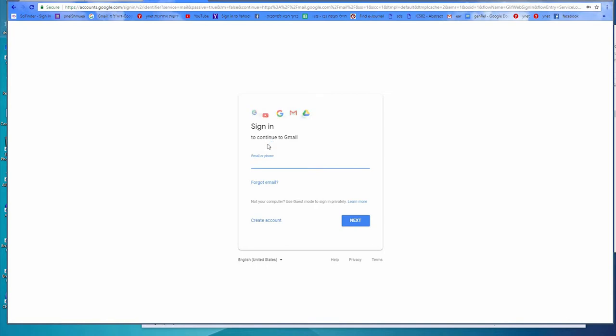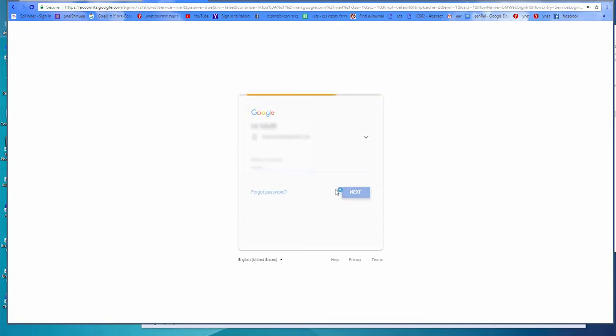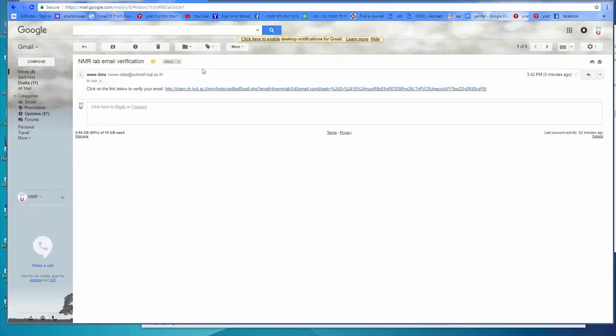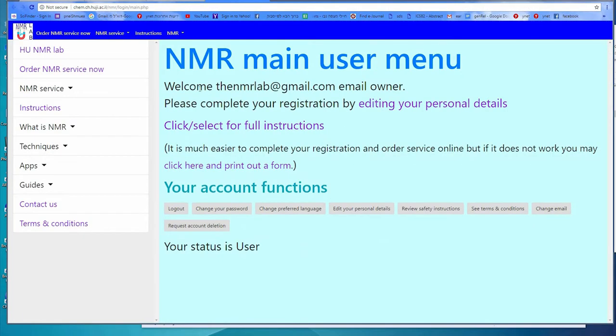You can then open your email in the same browser or open it in another program and copy the link from the email message into the browser. Log into your email address and you will find an email has just arrived from the NMR lab server. Open it, and click on the address there — that will verify your email and you will be sent directly to the main menu.